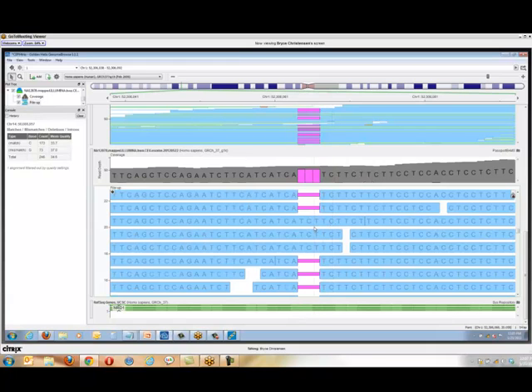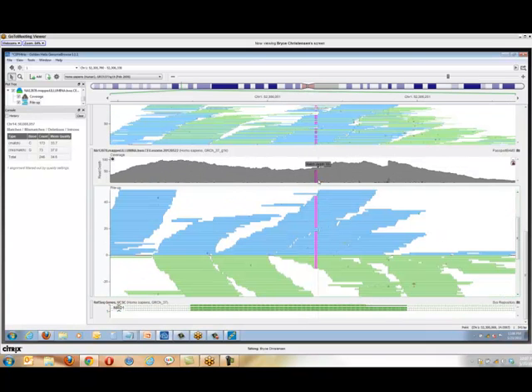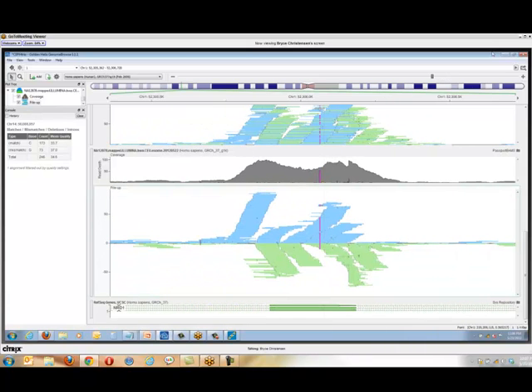Those repeats, we already said it's tricky with how to annotate them, but it's also tricky with how to align them and call them. And most alignment algorithms use this local de novo assembly or this local realignment around an indel. But even when you use that, you still run into tricks like this, where it's obviously a homozygous deletion, but it's difficult to show.